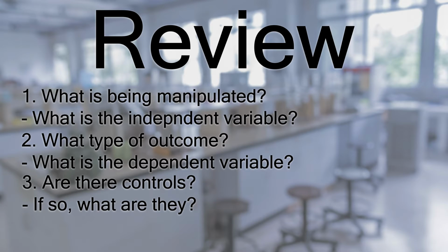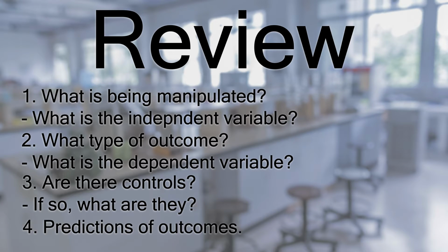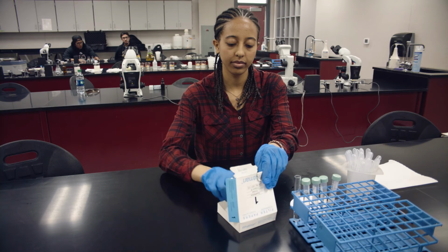Number 3, are there controls? And if so, what are they? And number 4, what types of predictions of outcomes can you make before actually conducting the experiment?